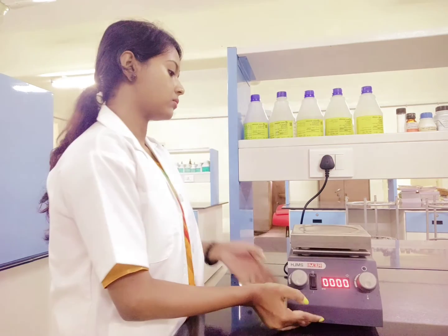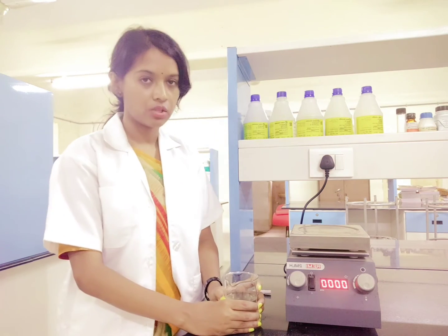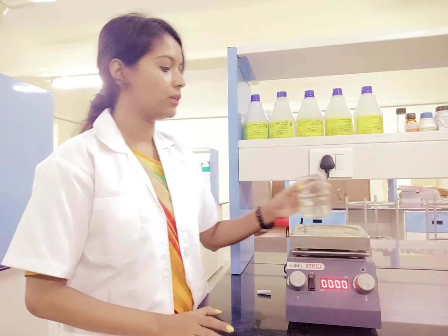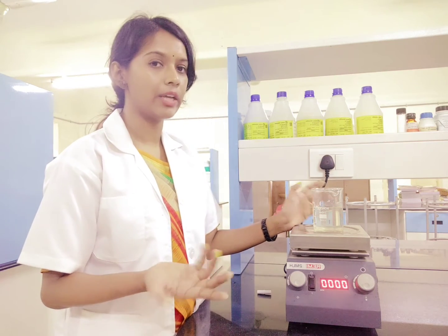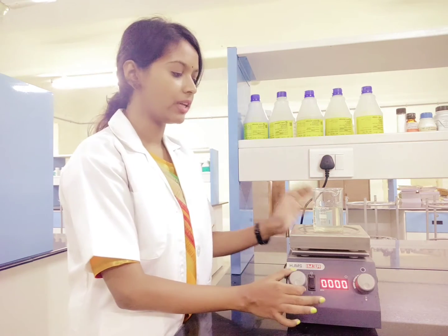Now, talking about keeping the sample — suppose you have a food sample from which you want to extract any component, for example anthocyanin. What you have to do is take the food sample in a beaker and add the solvent in which you want to extract it. Once you have done that, keep it on the plate. If you want temperature you can regulate it with the temperature controller; if you do not want it, just keep it off and increase the speed.